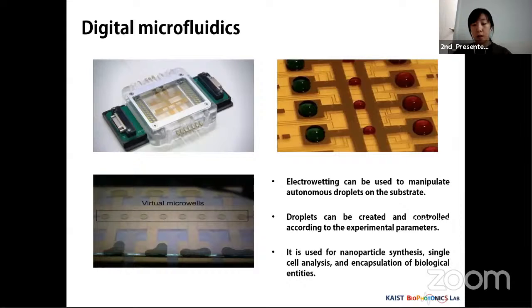So let's take a look at the types of microfluidics. First, digital microfluidics can manipulate droplets on the substrate using electrowetting.